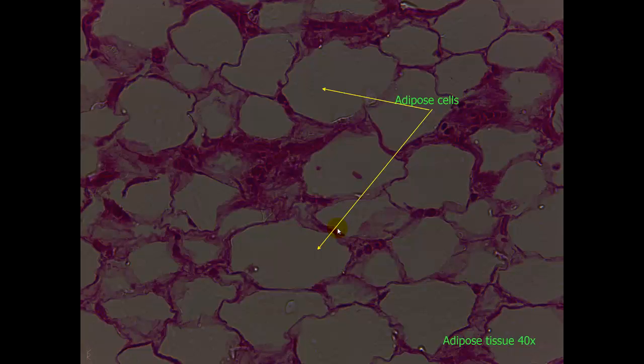Let's take a closer view. Here we have a closer view of the adipose cells themselves. Notice that you don't see any nuclei. This is a 40x objective. There is not any nuclei and you also don't see the adipose tissue itself. It is contained within there. We just can't see it.